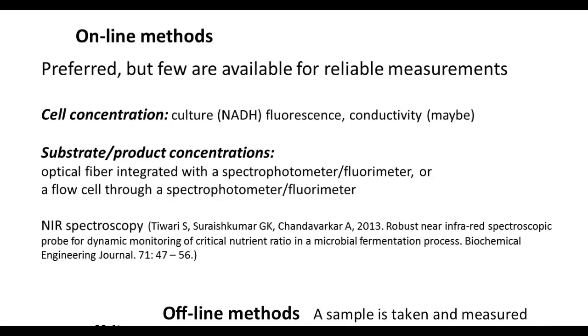You could use absorbance or fluorescence for some substrates and some products. What is recently of interest is what is called near-infrared spectroscopy. In fact, we have a paper on this. The work was done by Sanjay Tiwari, developed as a part of his PhD thesis, and was also applied in the industry.